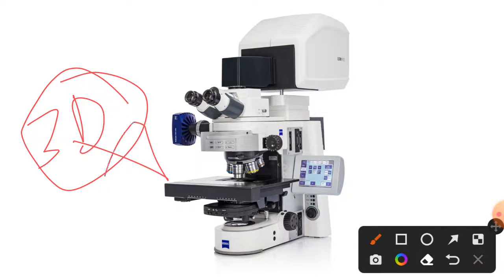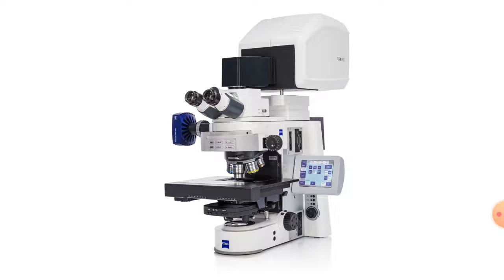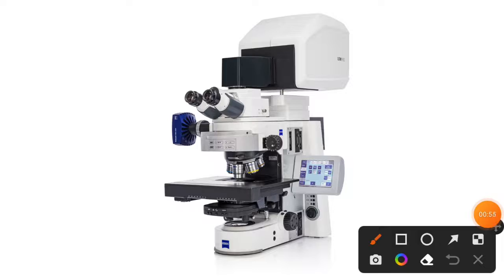Not only that, whenever we use those kinds of microscopy to visualize a 3D specimen, they create a fuzzy and murky image. In easy words, you can also say an unclear, or in other words, blurred image.